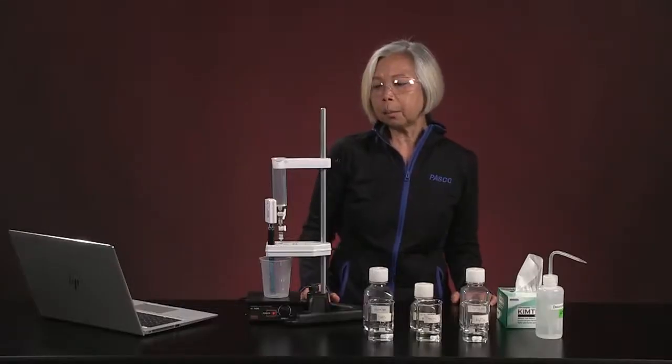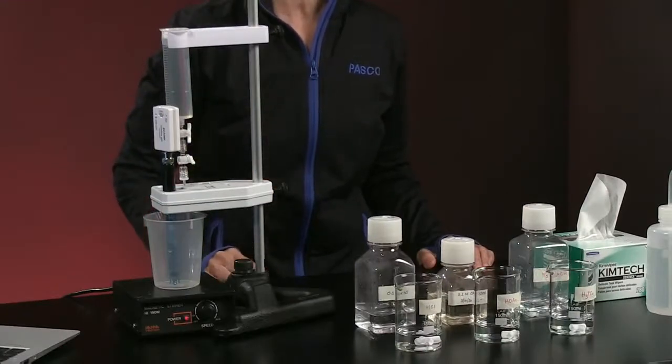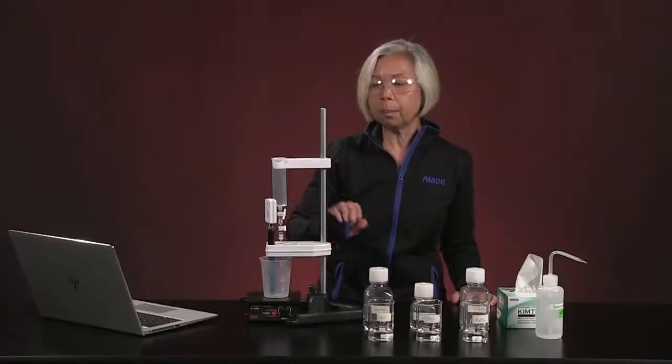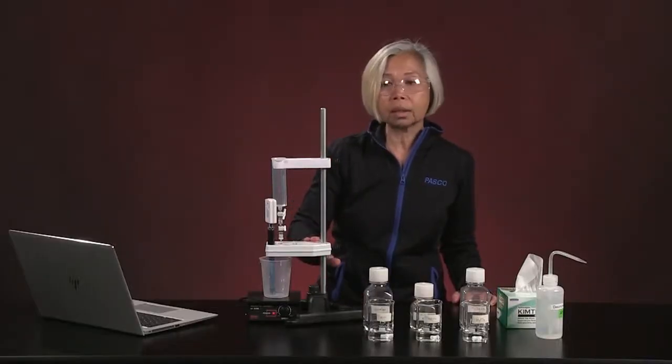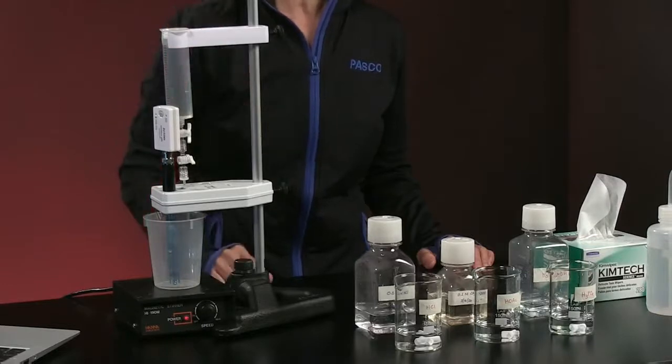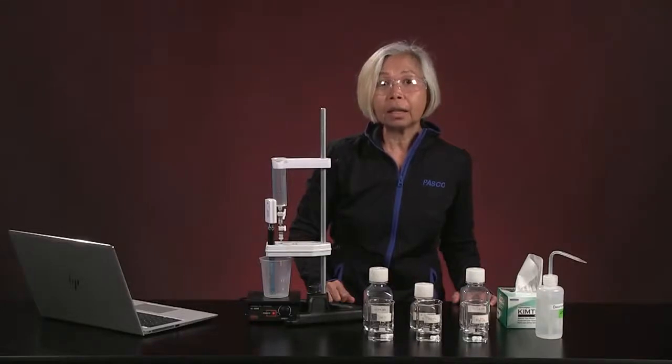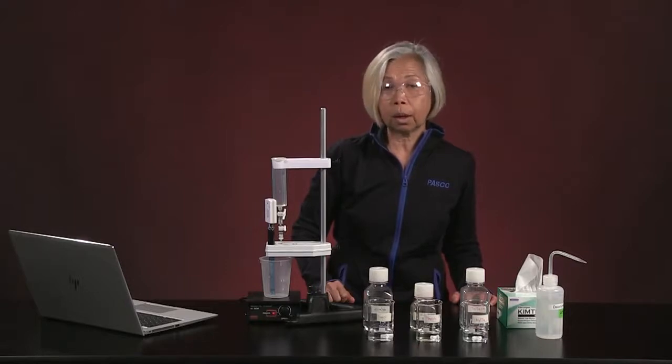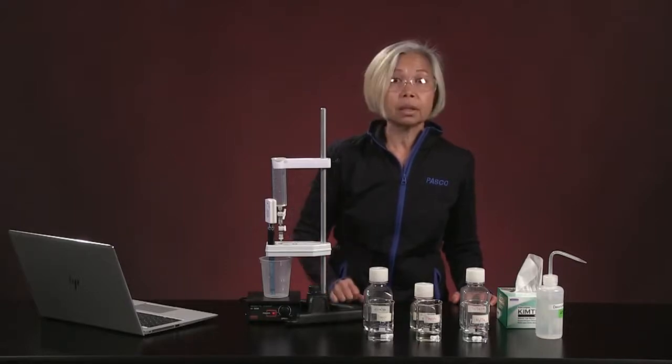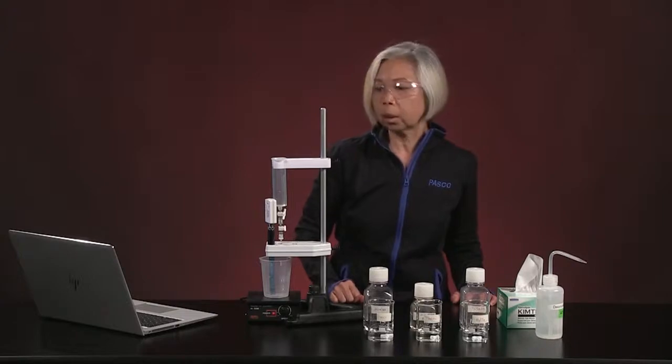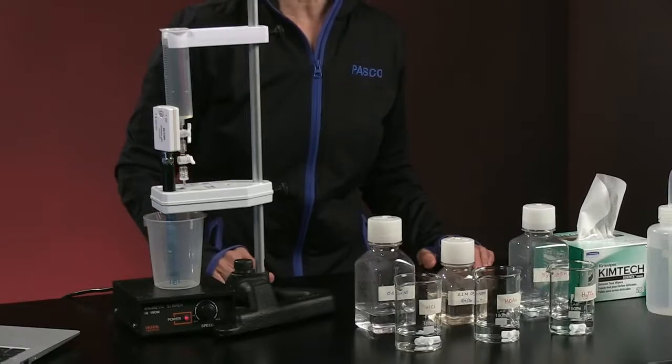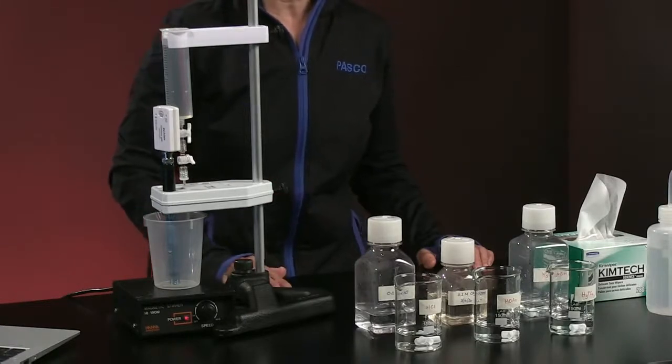As you can see, to set up this lab, we are using a wireless drop counter, as well as a wireless pH sensor. We have set up a syringe assembly that comes with a wireless counter, and in that syringe assembly, we have filled it with 0.1 molar sodium hydroxide. That is our titrant. That sodium hydroxide has been prepared from solid sodium hydroxide pellets and has been standardized at 0.1 molar concentration. The pH sensor itself has been rinsed with water and is ready to go.